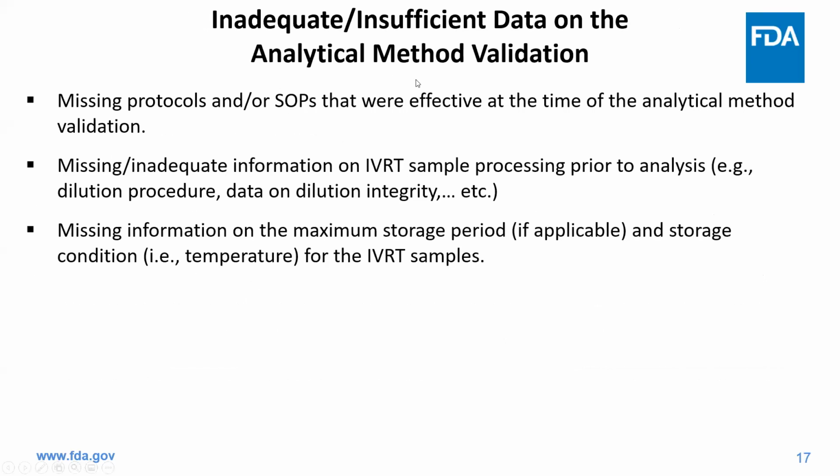And when it comes to analytical method validation, sometimes applicants do not submit the SOP or protocol that was effective at the time of the analytical method validation, or missing information on the IVRT sample processing prior to analysis. And sometimes the applicant does not submit information on the storage period and storage conditions for the IVRT sample prior to analysis.